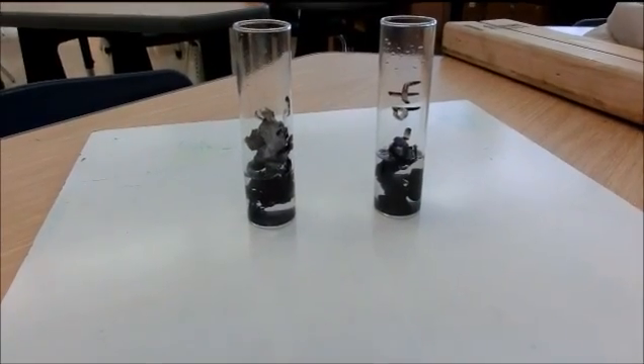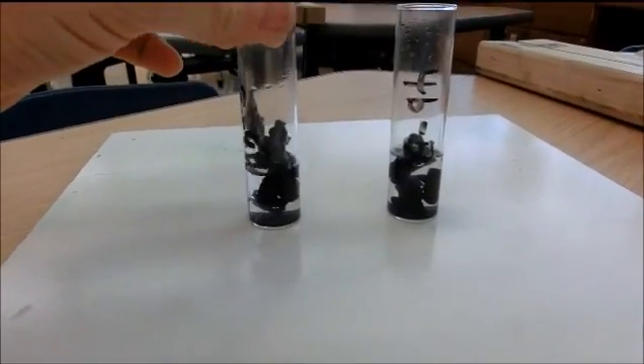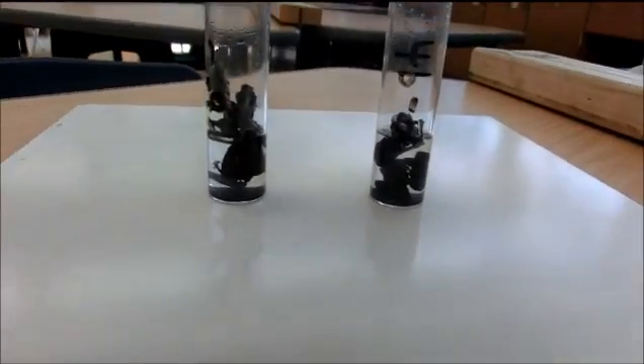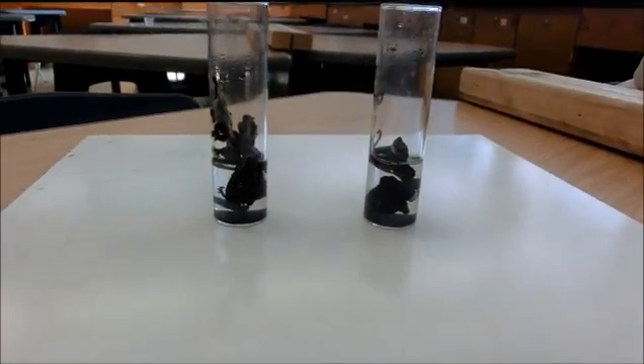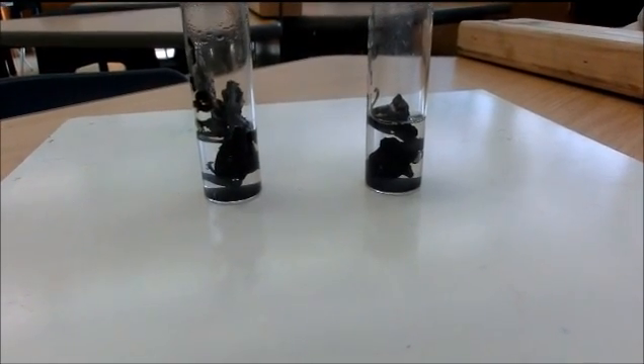These are the tubes of zinc and hydrochloric acid that were left overnight. As you can see, some of the zinc has reacted in both classes, and a lot of zinc still remains, but there is no bubbling left over from the night before.